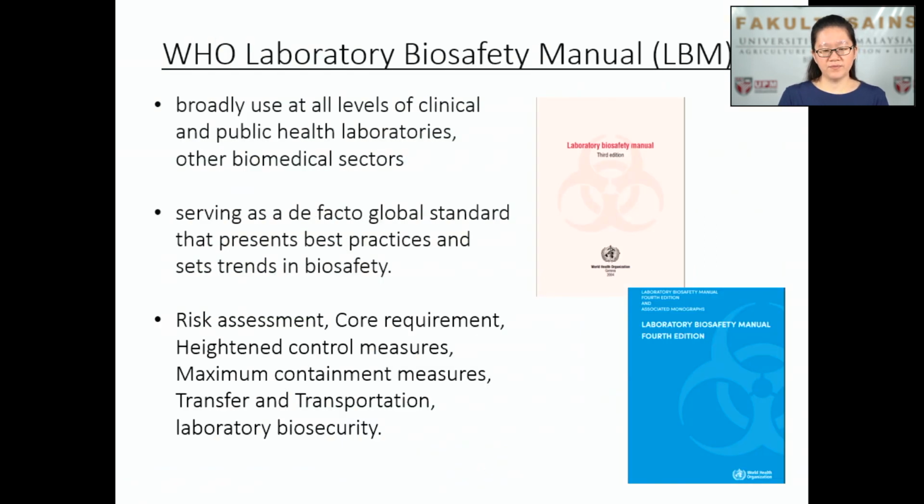The WHO Laboratory Biosafety Manual has been used broadly in all levels of clinical and public health laboratories and also other biomedical sectors globally. It serves as a de facto gold standard, a global standard that presents best practice and sets trends in biosafety. This particular biosafety manual includes risk assessment, core requirements, heightened control measures, maximum containment measures, transfer and transportation, and laboratory biosecurity.